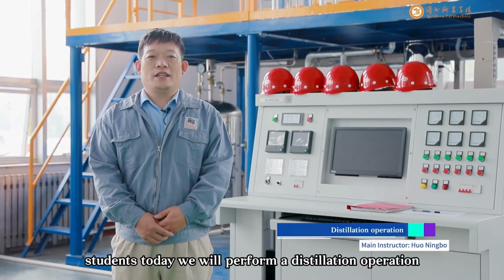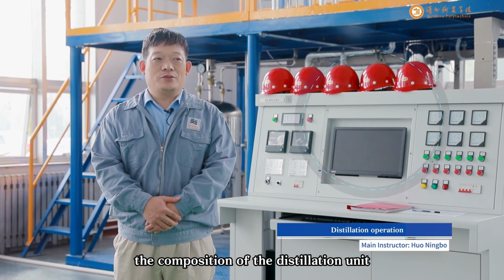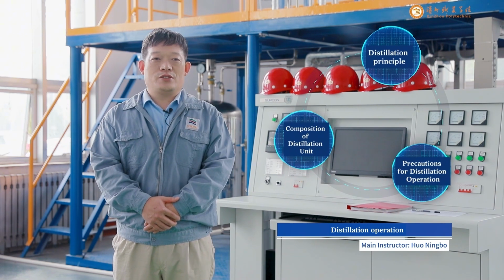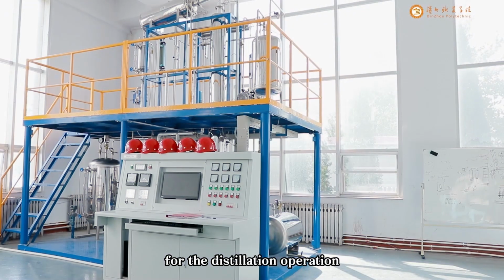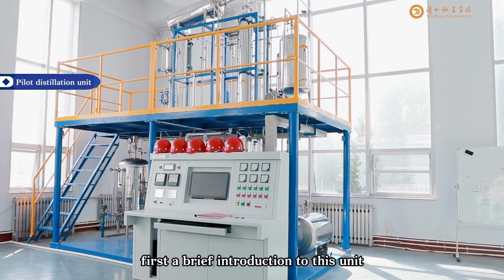Students, today we will perform a distillation operation. Before the operation, I want to explain the composition of the distillation unit, the principle of distillation, and the precautions for the distillation operation. First, a brief introduction to this unit.